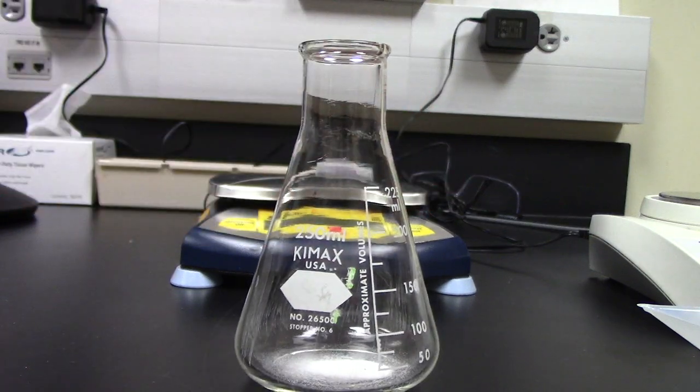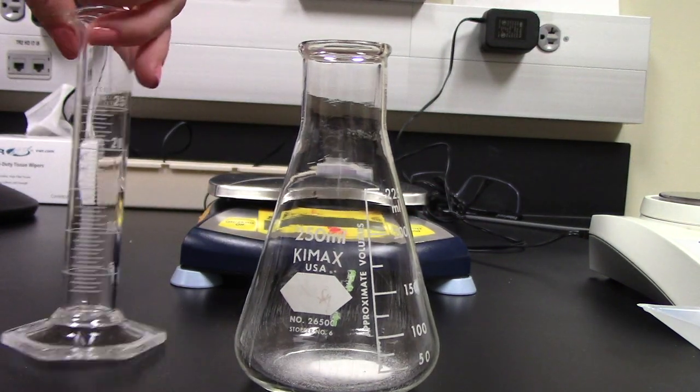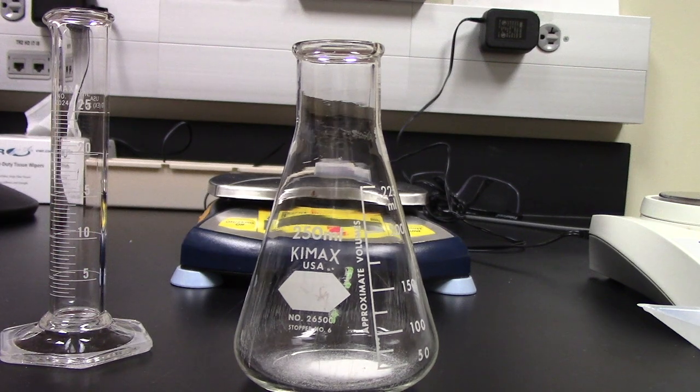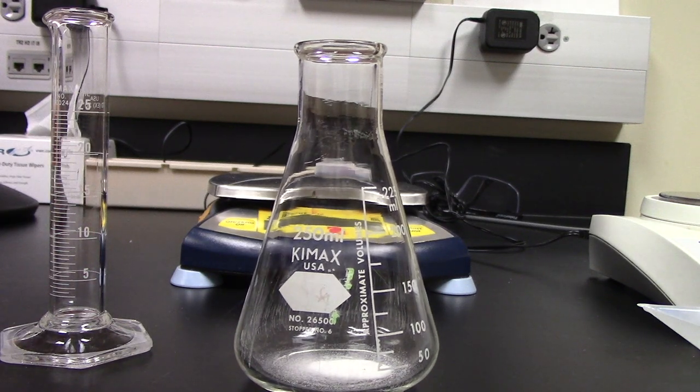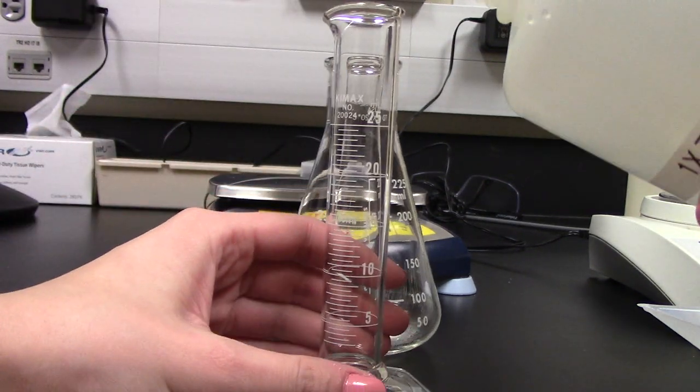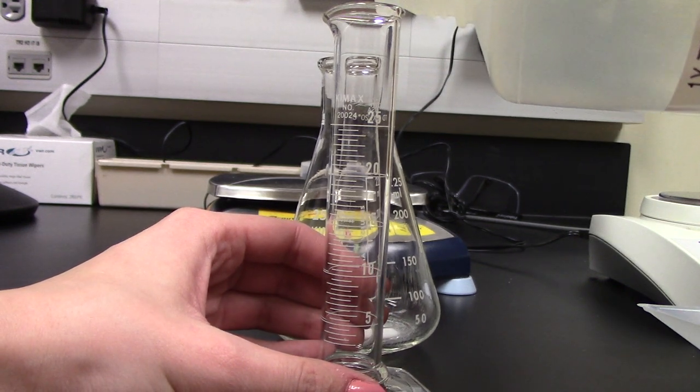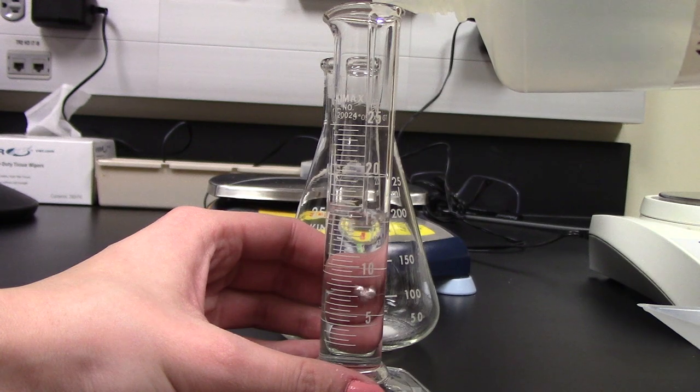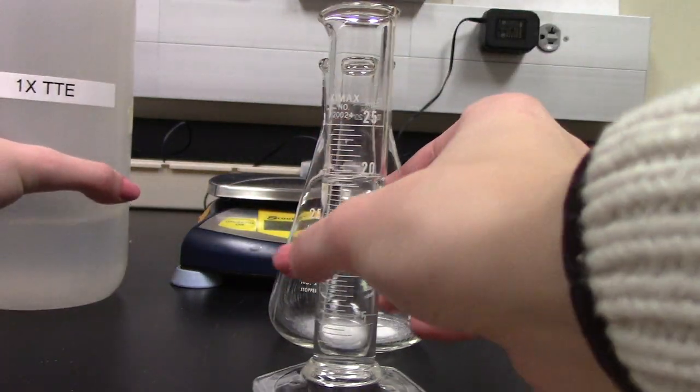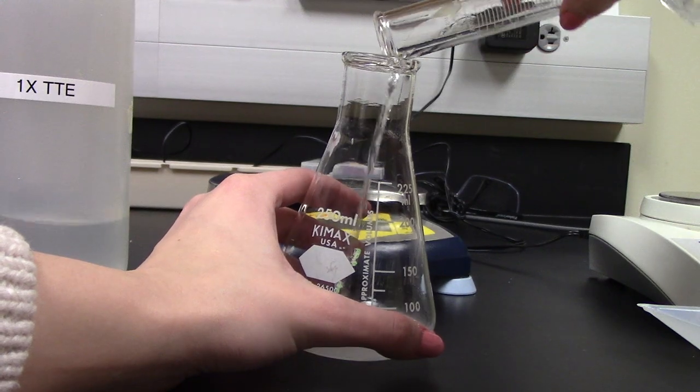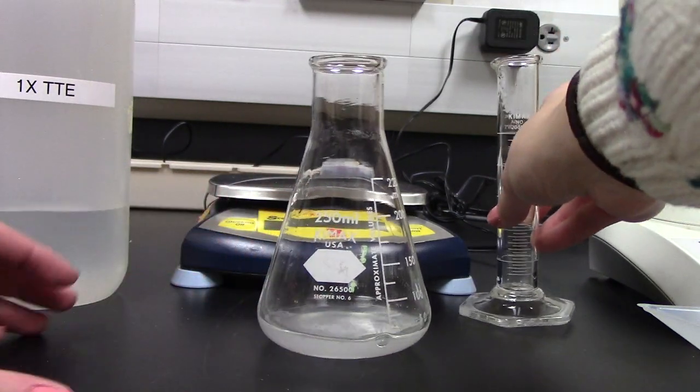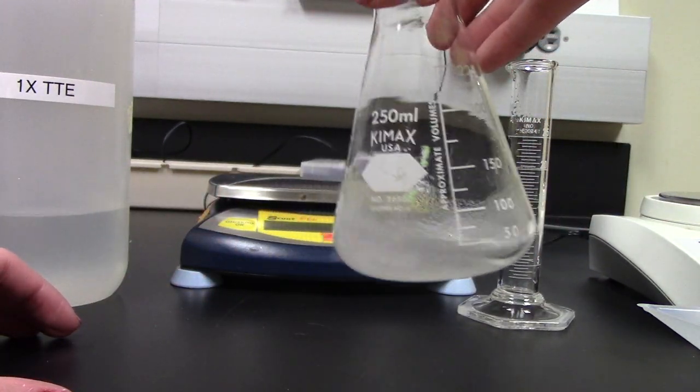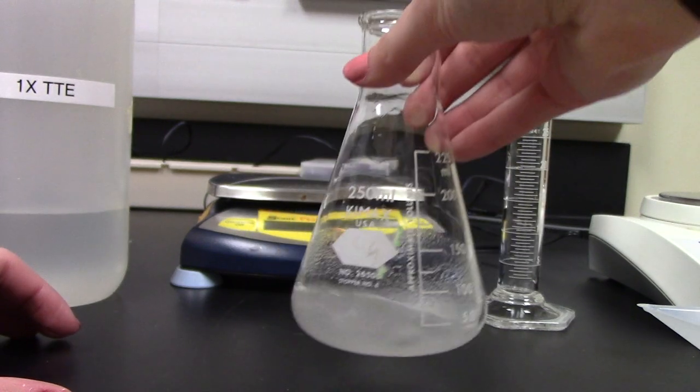I am also then going to want to measure out 20 milliliters of 1x TBE. I will do that now and then I'm going to add it into my agarose and swirl to mix.